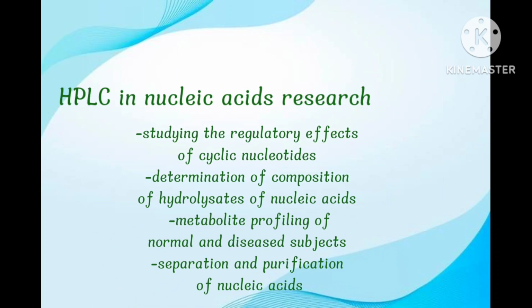HPLC in nucleic acids research. In nucleic acids research, the HPLC instrument has vital importance for some purposes like studying the regulatory effects of cyclic nucleotides, determination of the composition of hydrolysates of nucleic acids, metabolite profiling of normal and diseased subjects, and separation and purification of nucleic acids.